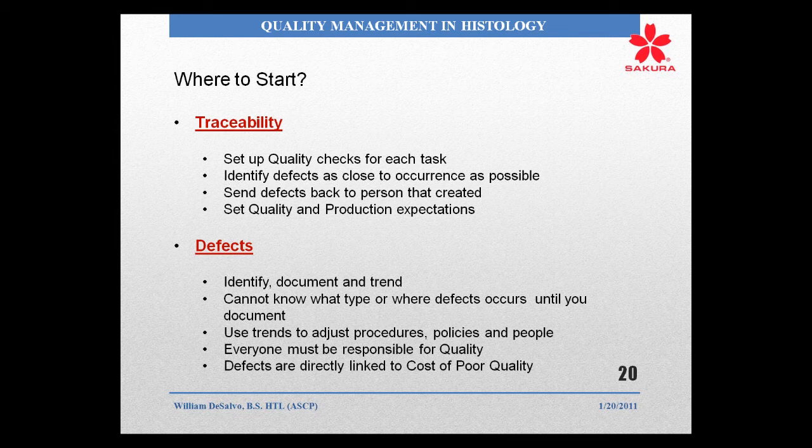Defects. This is what a lot of us don't like to talk about. Most of you will probably say that we don't have any issues in my laboratory. I'm going to say that is 100% incorrect. It's a manual process. What my experience has been, and what I've been trained to understand, is that with a manual process it's quite understandable to have anywhere between a 1 and 2% defect or error rate. Think about that: 1 or 2% of your slides or blocks or stains each and every day have some sort of procedural, technical, or quality defect in them. That seems unacceptable. That is unacceptable. Our goal is always 0, but it is happening.